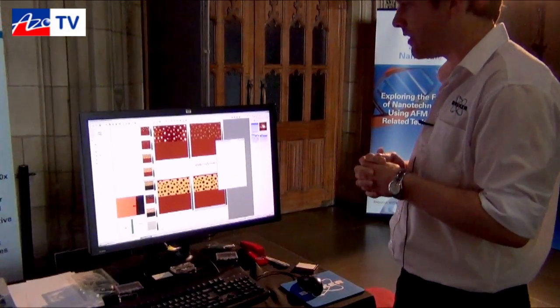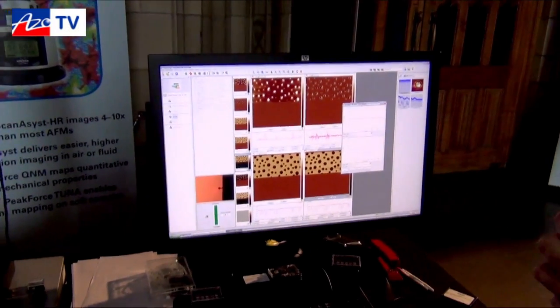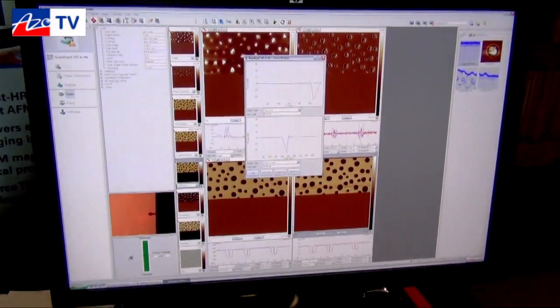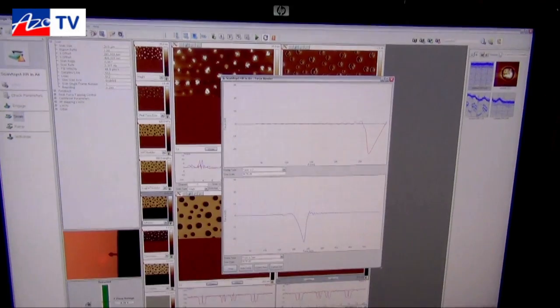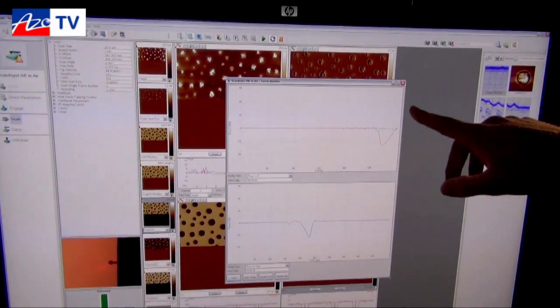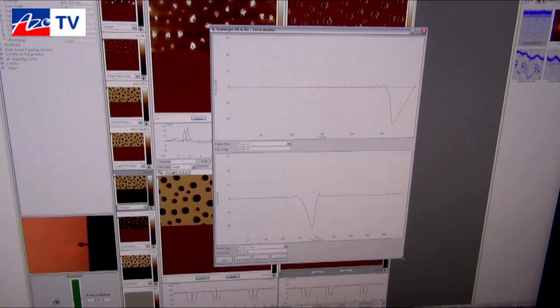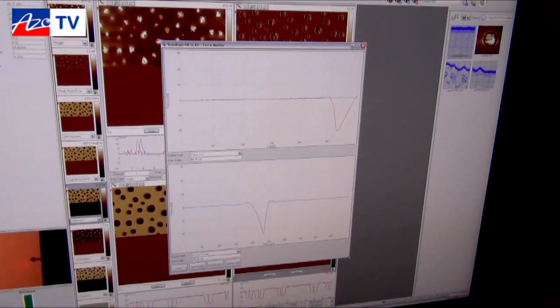The way the imaging mode itself actually looks: the system is now running on a polystyrene low-density polyethylene blend, and what we see here is the heartbeat or the base of the system, which are essentially all of these force curves — in this case 2000 per second. We see the blue which is the approach curve and the red which is the retract curve, and directly from this we can extract things like modulus, adhesion, deformation, and dissipation in real time.